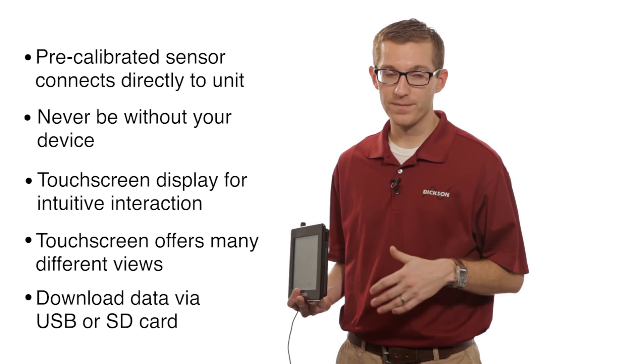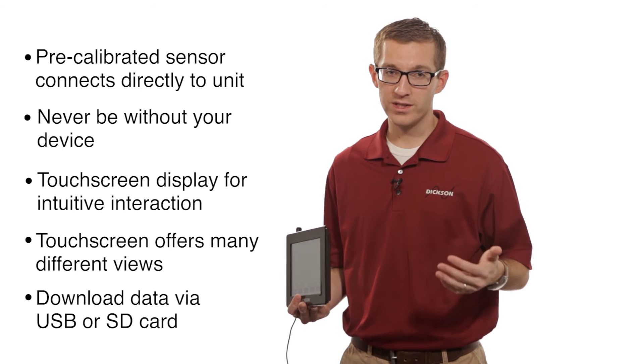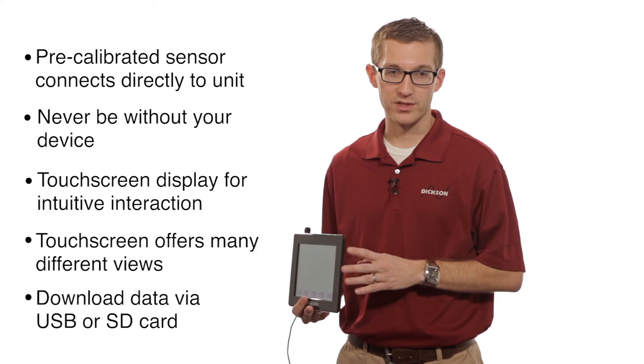Take it back to your computer, and then you can use the information to create reports, print, email, fax — do whatever you need to do with that information.